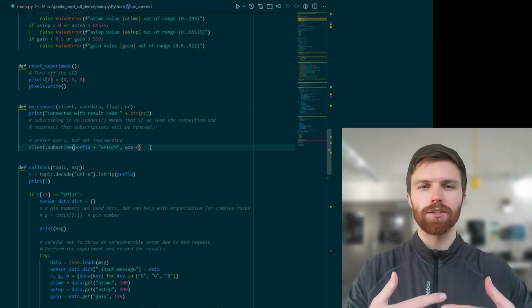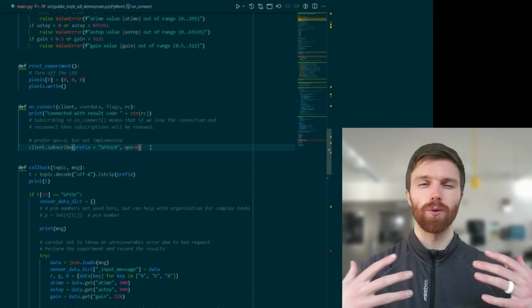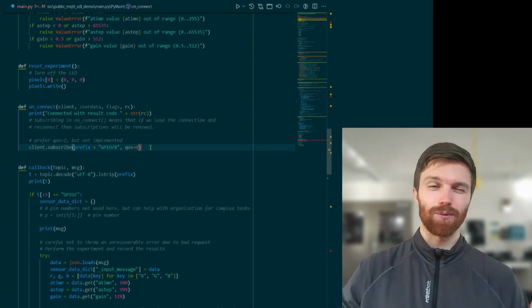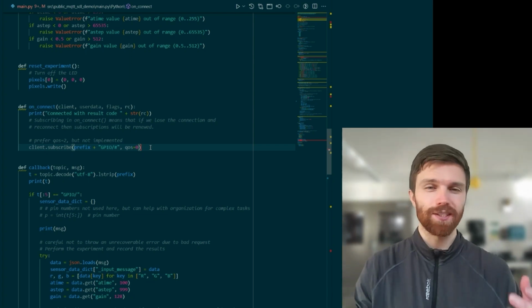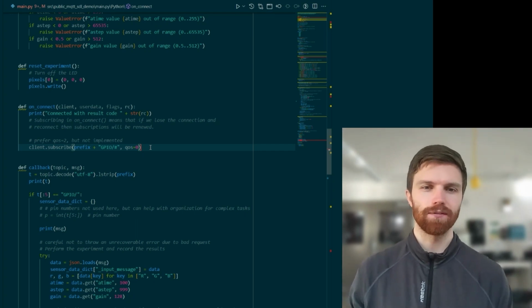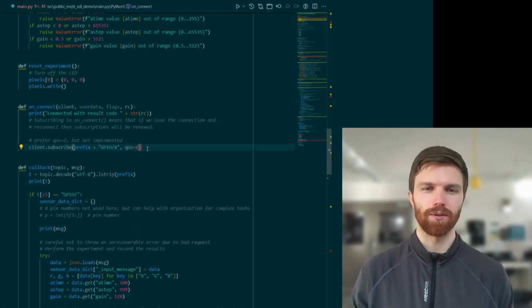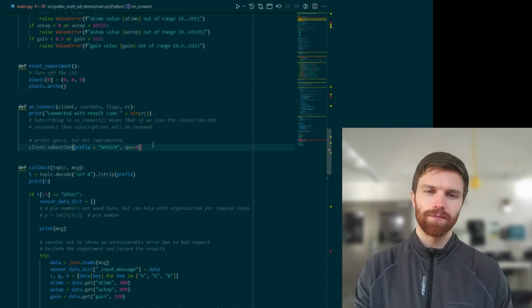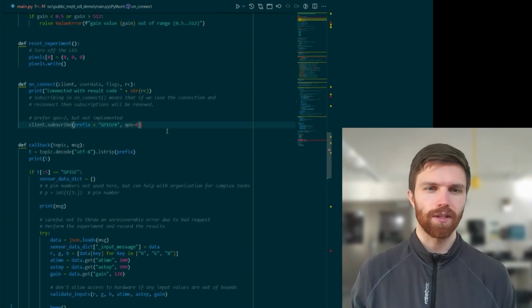Whether they do this handshake to make sure that the data was received only once, or whether they just make sure that the data gets received at least once, or if it just doesn't even check and just tries to send it once, and if it does or doesn't get received. And that's QoS 0, is that it sends it, and if something goes wrong, it doesn't handle the error there.